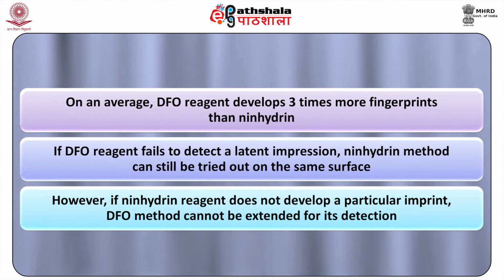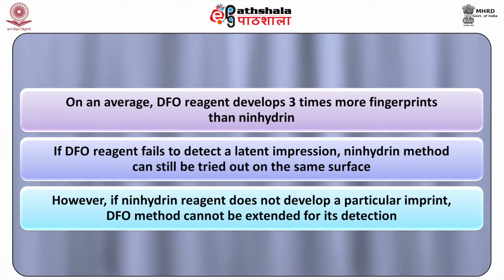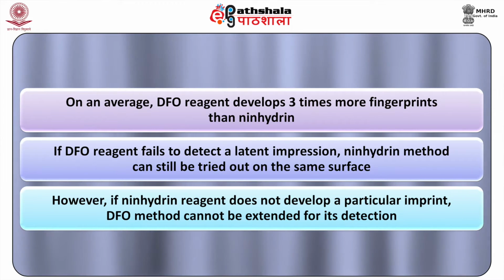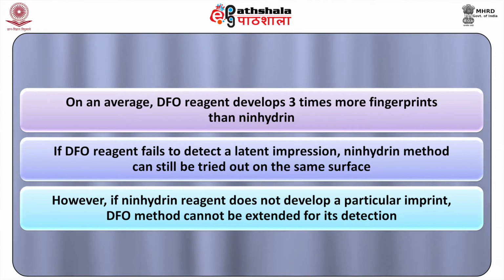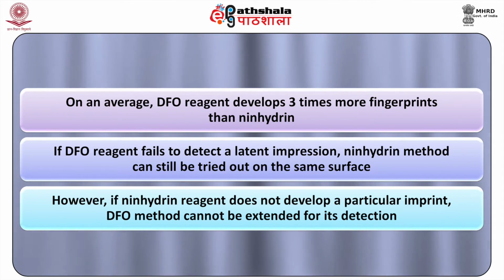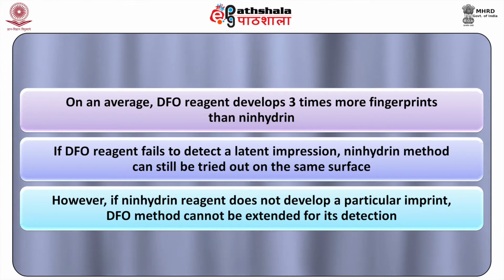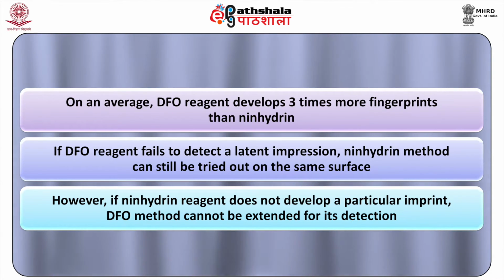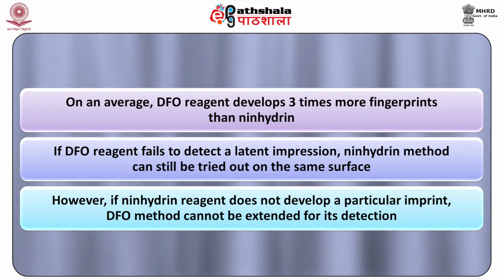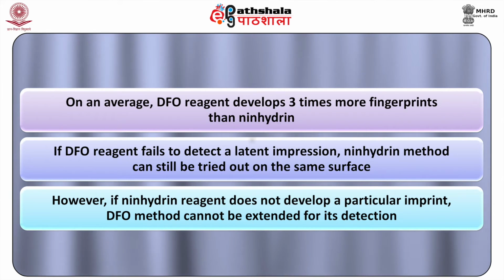Number 3. On an average, DFO reagent develops 3 times more fingerprints than Ninhydrin. Number 4. If DFO reagent fails to detect a latent impression, the Ninhydrin method can still be tried out on the same surface. However, if Ninhydrin reagent does not develop a particular imprint, the DFO method cannot be extended for its detection.